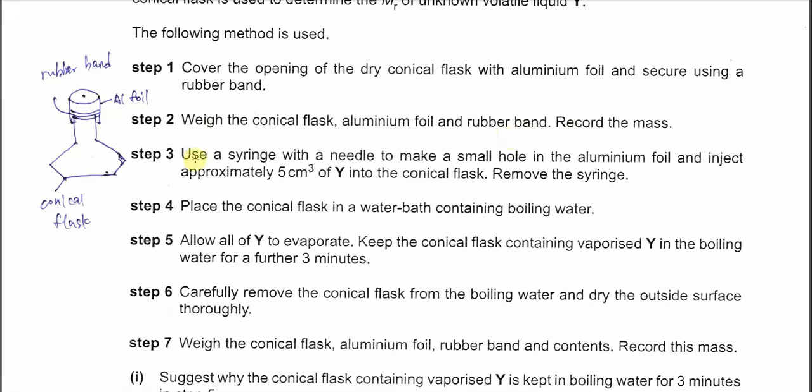Step 3 is to inject the sample now. Use the syringe with a needle to make a small hole on this aluminum foil and inject about 5 cm cube of the liquid Y into the conical flask. Then remove the syringe. So therefore, this conical flask has a small hole. It's not really a closed system, meaning some of the gases can still escape here, because there is a small hole there.